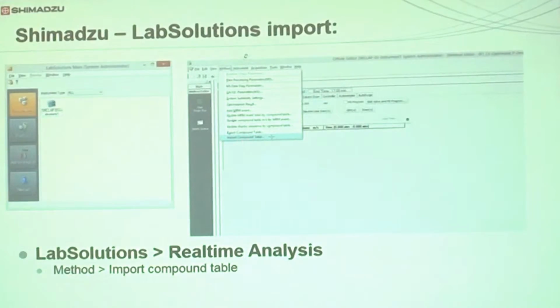After that you will specify what should be the time program, the HPLC time program, and whether you want to do scheduling or staggering; that you can specify, and what column you want to use, that you can specify. After all these parameters are optimized, you can give a run and perform the analysis. After the analysis is over you can import that result or data file in Skyline software again, and you will be seeing different colored symbols.